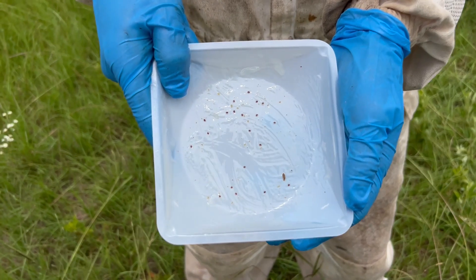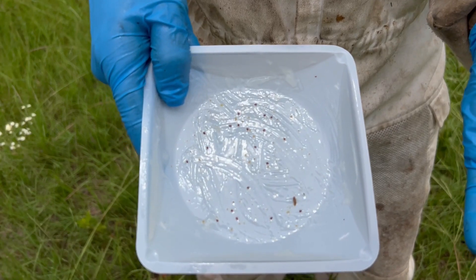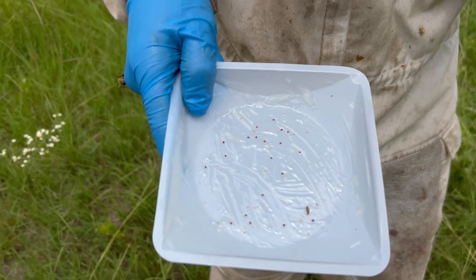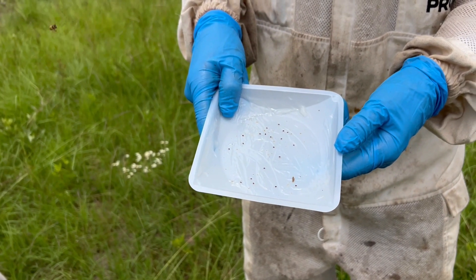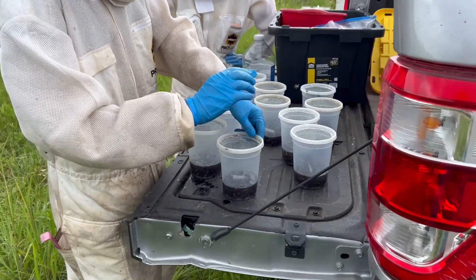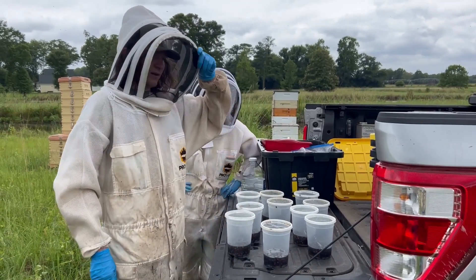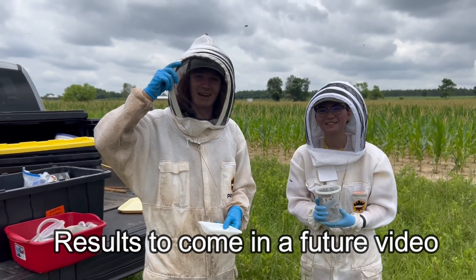What do we have here? We have one that actually had a good drop. It either means there were a lot of mites in the sample, or we had a decent amount of drop from that Apivar strip — hopefully his mites aren't too Amitraz-resistant, because otherwise he might have quite a high mite load. That's the alcohol wash on a previous sample from somebody else. This is the real deal here — Auburn Bee Lab, a pretty prominent program in the beekeeping industry. I sure appreciate what you're doing and for coming down here today, and I look forward to seeing my results.